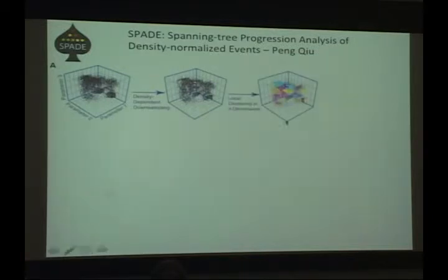From there, we just do n-dimensional clustering. So here we're showing 3 dimensions because it's easy to visualize, but we're typically doing this in about 15 or so dimensions of the data. It does get a little noisy when you try and start doing 30-dimensional clustering. It also gets quite computationally intensive. So the sweet spot is somewhere in the, I'd say, 7 to 15 range of parameters that you cluster on. But obviously that gives you a lot of diversity. And you can see that this clustering step forms multiple different clusters in the data.